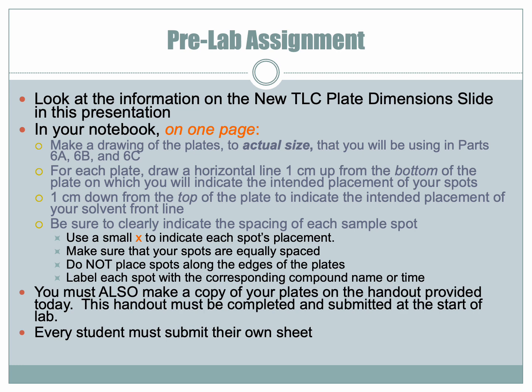Look at the information on the new TLC plate dimension slide in this presentation. It's on the next slide. So in your notebook, on 1 page, make a drawing of the plates that you'll be using in parts 6A, B, and C. This is, if you click on the pre-lab assignment in Moodle, you'll understand what I mean.